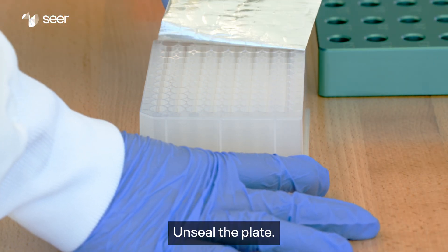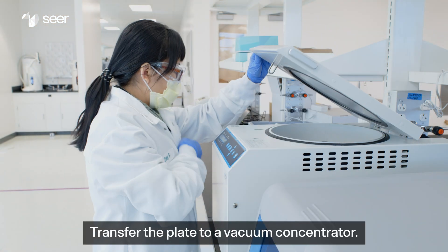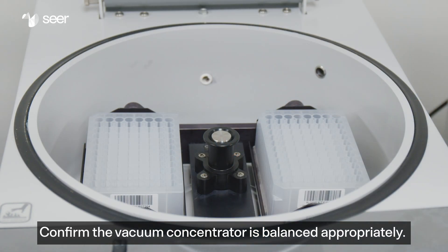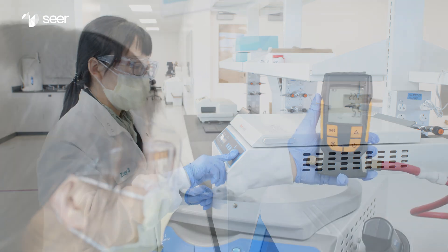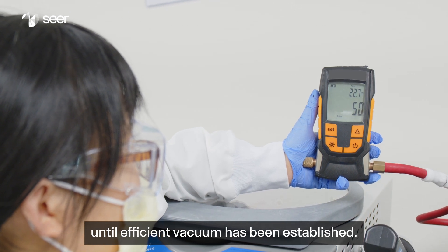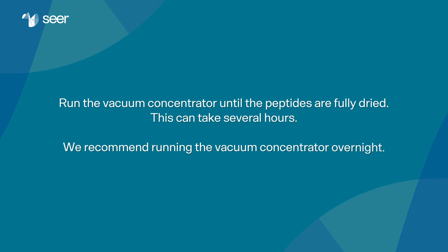Unseal the plate and transfer it to a vacuum concentrator. Confirm the vacuum concentrator is balanced appropriately. Set the temperature to 20 degrees Celsius or lower. Do not walk away from the vacuum concentrator until efficient vacuum has been established. Run the vacuum concentrator until the peptides are fully dried. This can take several hours; we recommend running the vacuum concentrator overnight.